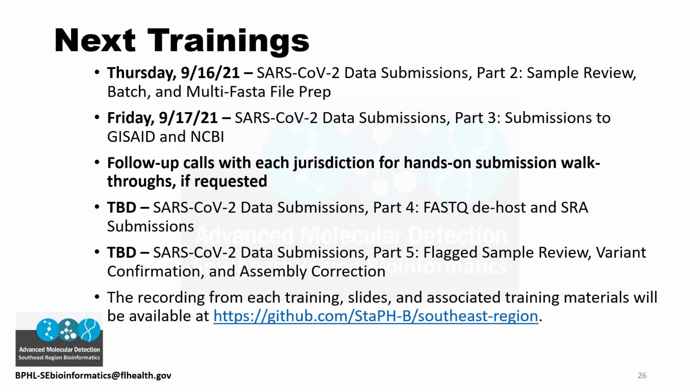And then Friday, you'll have your FASTA files already made, and we'll go over all the different metadata templates for GISAID and NCBI and walk you through step by step each one of their portals on how to submit that data. And then after that, if your jurisdiction would like, we can have a follow-up call with just your lab to go hands-on, walk through, and share screens on your side with your own data.